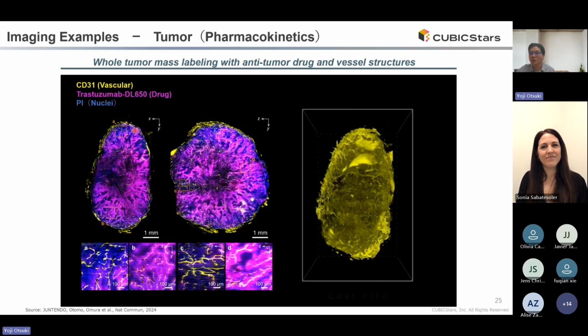When researchers successfully identify such mechanisms, that also opens the possibility to modulate drug distribution efficiency inside the tumor mass. This result clearly shows that you should consider how the drug is distributed across the tumor mass. Some areas are not efficiently treated in these cases. So modulating and improving the drug distribution will be very important for future cancer studies and treatment.